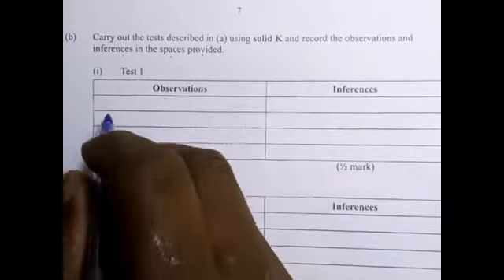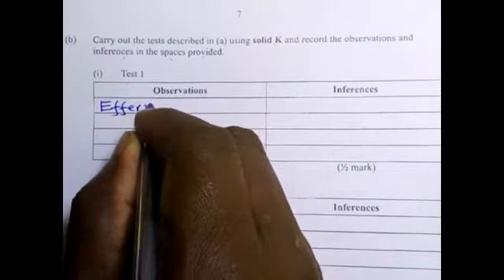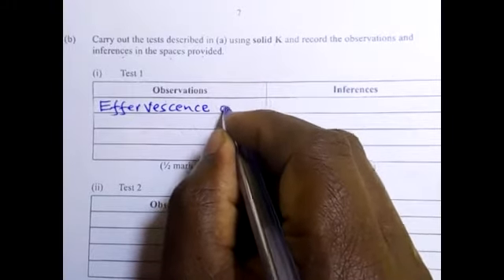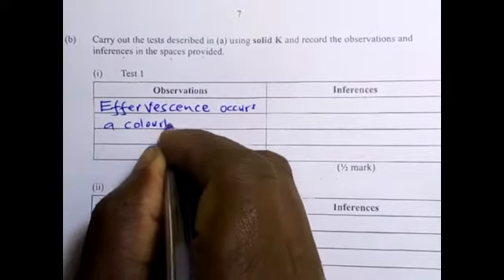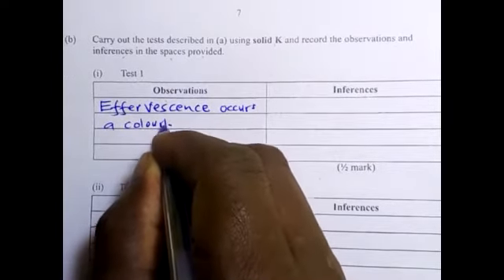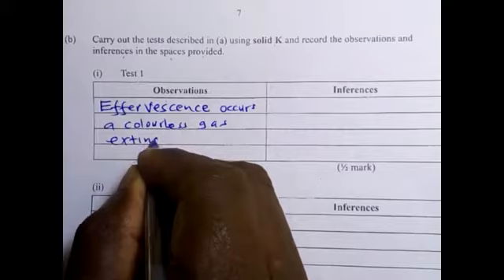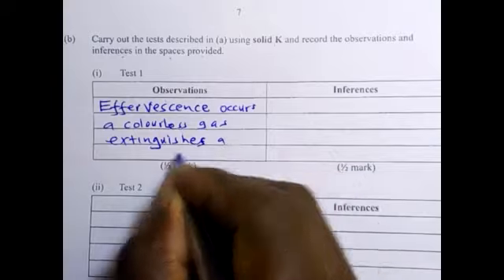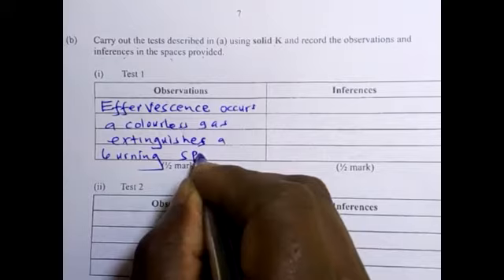So here the observation was, as we have said, that effervescence occurs, a colorless gas extinguishes a burning splint.